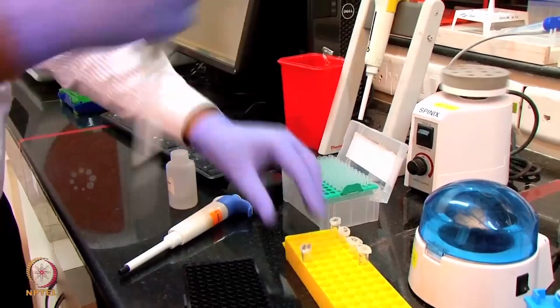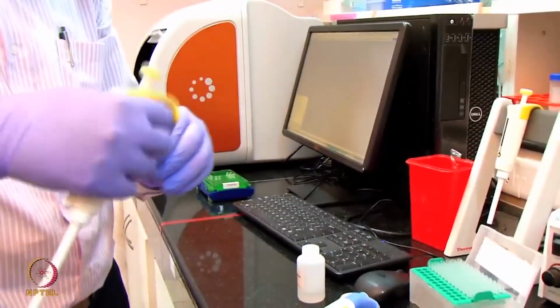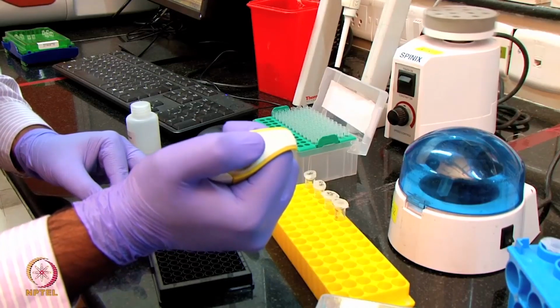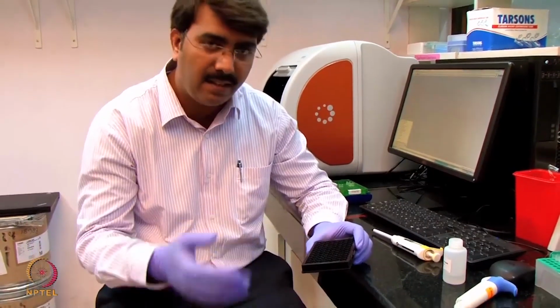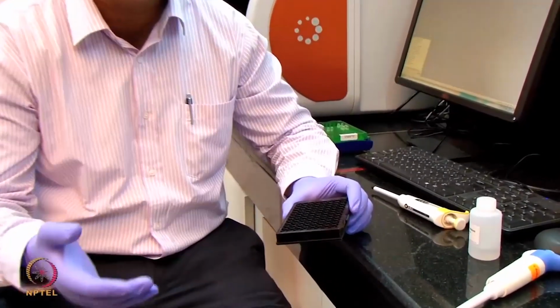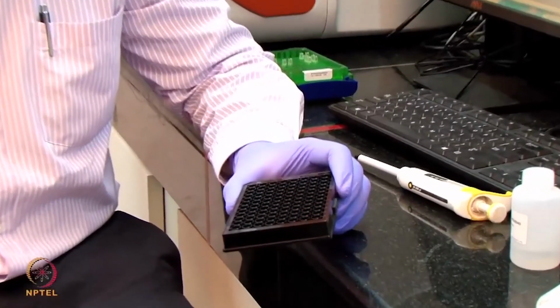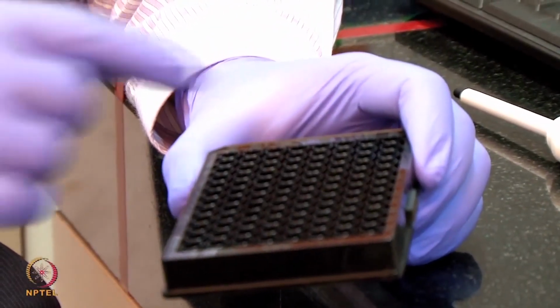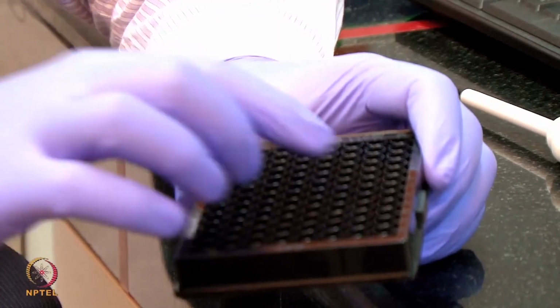Here, this is the 50 microgram per ml protein. I'm serially diluting, doing a two-fold dilution in the plate. So now we have made 6 concentrations of the standard apolipoprotein, starting from a concentration range of 1.56 to 50 microgram per ml. I put these standards, the 1.56 in A3 through A8, the last being 50 microgram per ml, as well as a reference buffer, the buffer we are using for the reference subtraction. I put that at B6, B7 and B8.